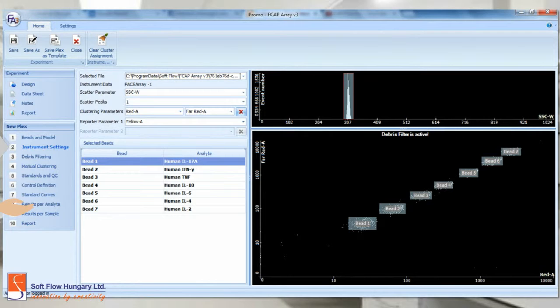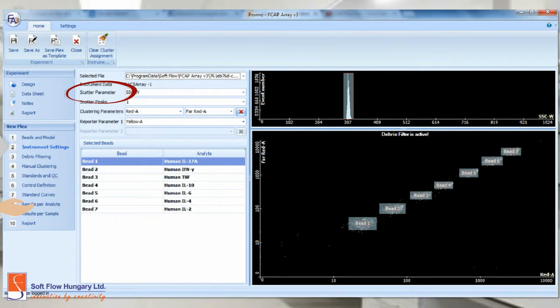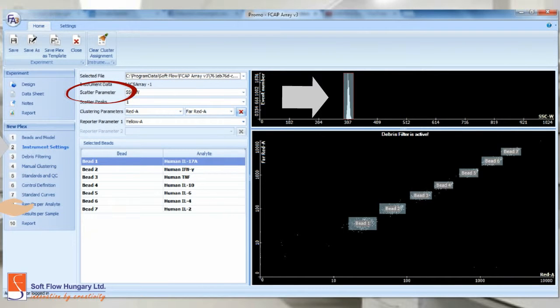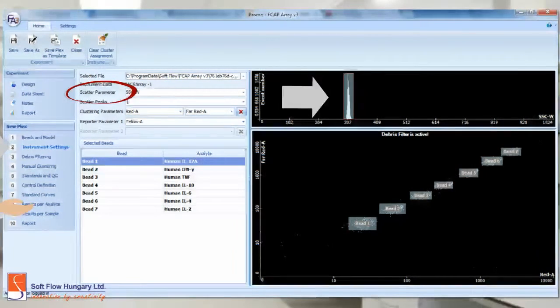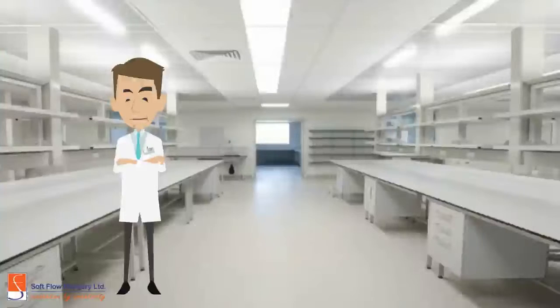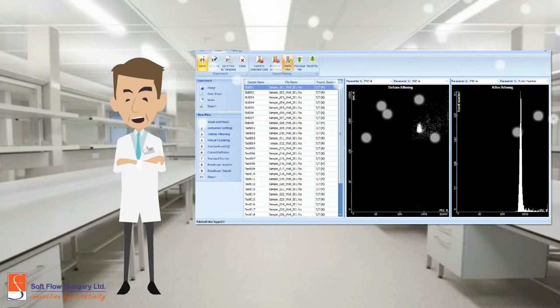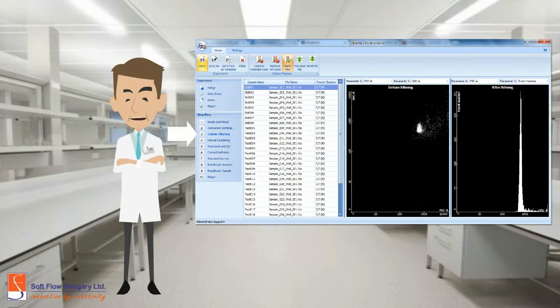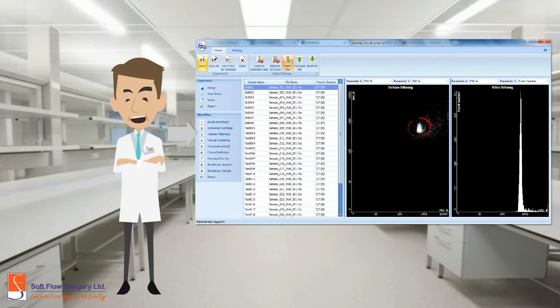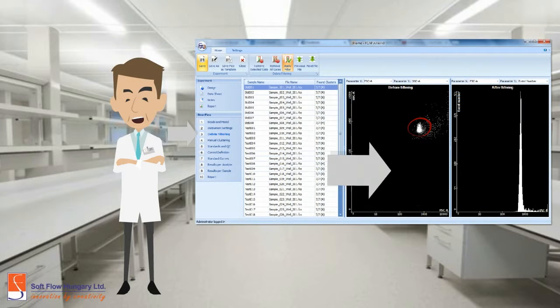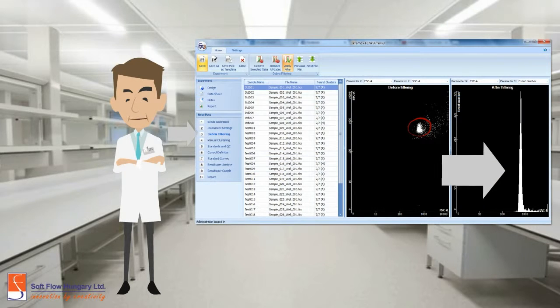Note the upper chart. You can select the scatter parameter. In this case, the side scatter was selected. Also, you can apply the debris filtering. Choose and modify the gates you want to analyze. The after filtering chart updates automatically.